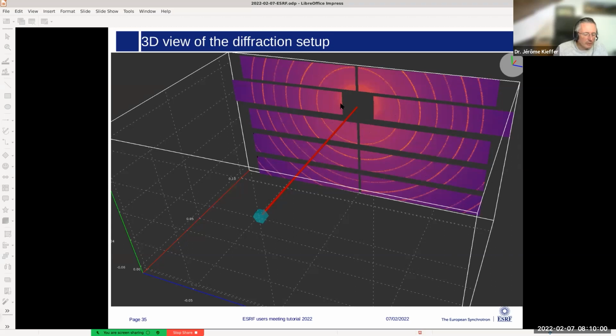And this is recorded in the sparse matrix, the CSR matrix that we are using later on. After this, only this sparse matrix remains, which is pretty large, but we can do very interesting things with it. Okay, thank you. This is what we will see with the sigma clipping part that we'll introduce later on.